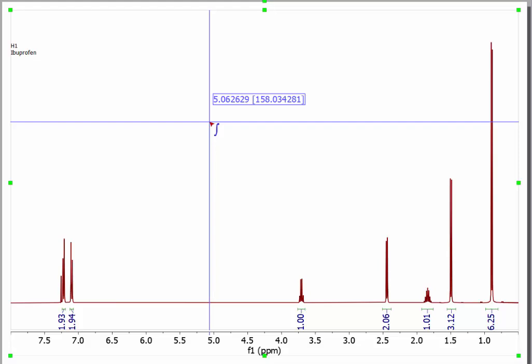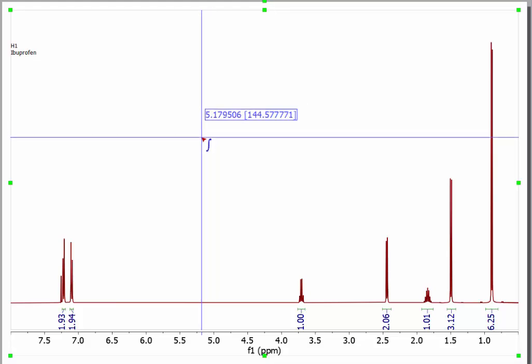This is arguably the most important video that I'm going to show you all semester, and it's primarily due to the fact that the topic that we're going to discuss right now, integration in a proton NMR, is one that has enormous value. But because it's relatively difficult to get your head wrapped around and it's difficult to perform integration on real spectra, students tend not to use it as much as they should.